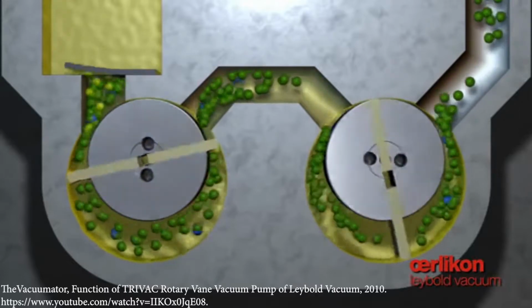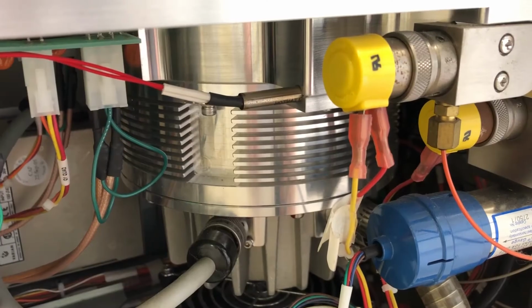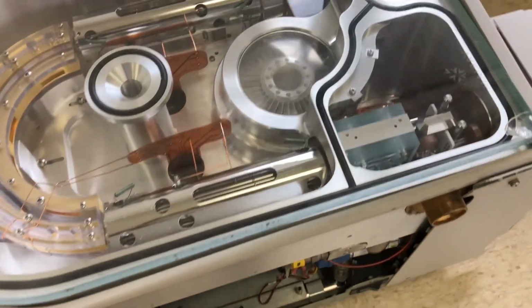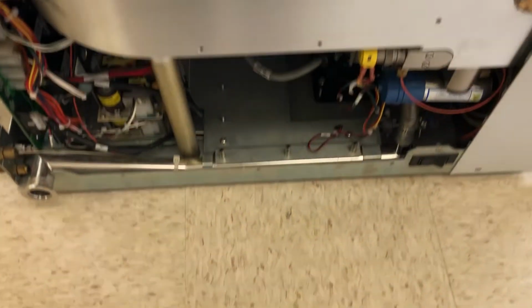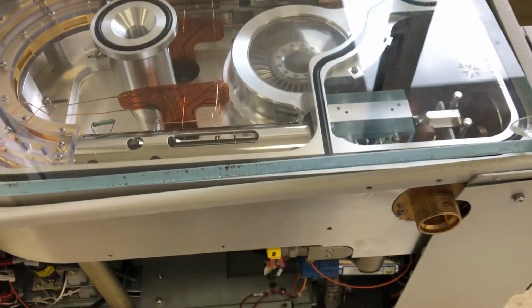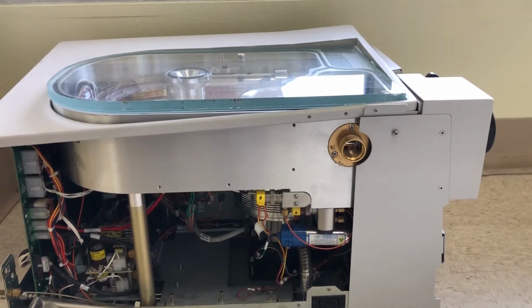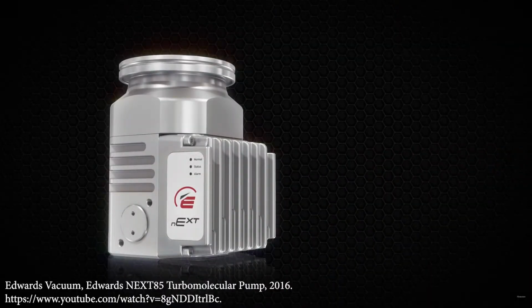But this is going to get you going with the vacuum. You need another stronger pump, usually a turbomolecular pump. This is a turbomolecular pump you see here to get you down to lower vacuums. It has that spinning vane on top, and then there's that big base. You see that it's shoved up into the instrument chamber, and it's just sucking gas out of the chamber. This is called a turbomolecular pump. It doesn't have to be a rotary vane pump and a turbomolecular pump, but that's the most common combination.